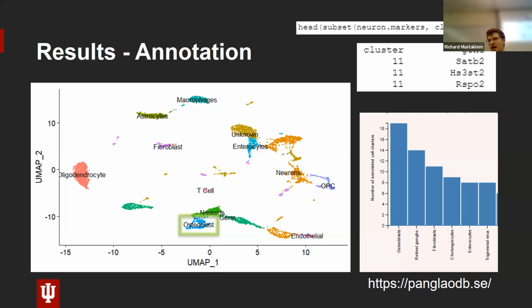And also this was just a practice data set, so it's not very realistic, but I just quickly threw this together a few days ago. And some of the annotations might be a little scuffed, but for the most part, this is how you annotate and how you make inferences. But you're really just looking at the position in the graph.